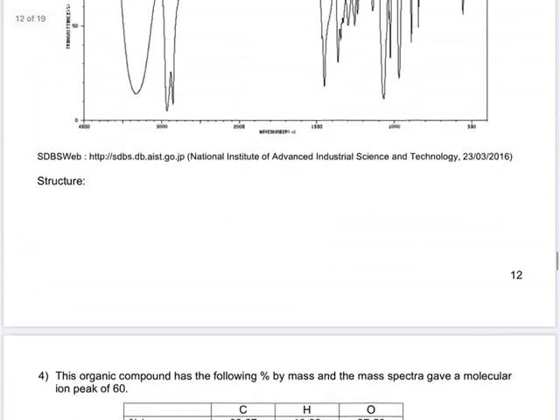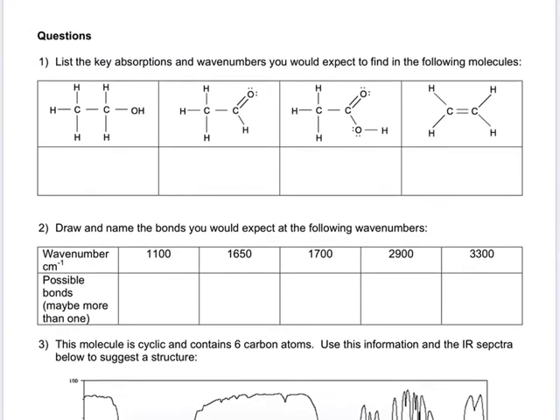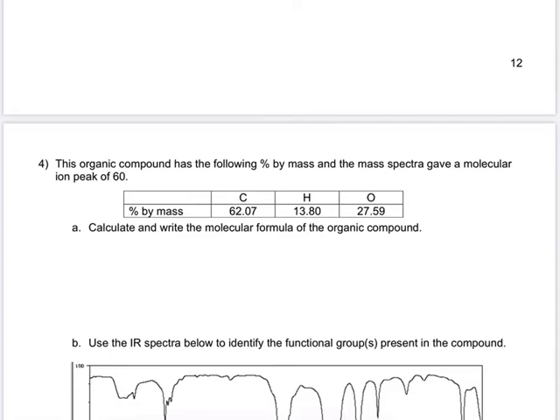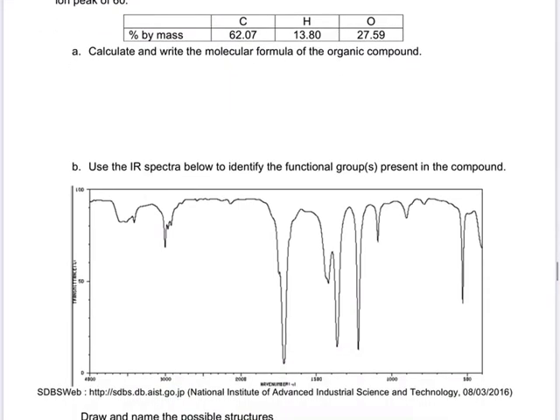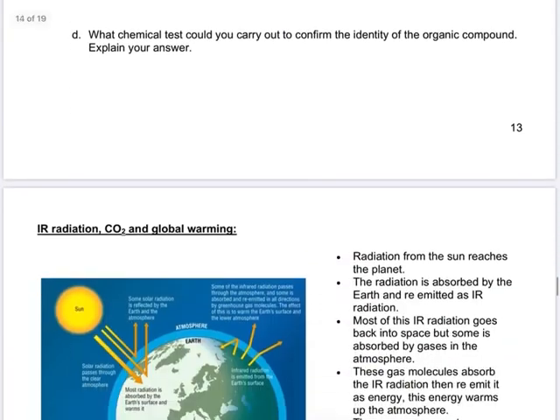And again, the way to remember, with all spectroscopic techniques, they just give you an extra clue. It's a bit like a detective story. You get a little bit of clue from infrared spectroscopy. You get another clue from working out the empirical formula and the molecular formula. You put all these clues together. You get the Mr from the mass spec. And of course, all of these things together give you little bits of clues, which then together give you quite a powerful analysis tool. Okay.